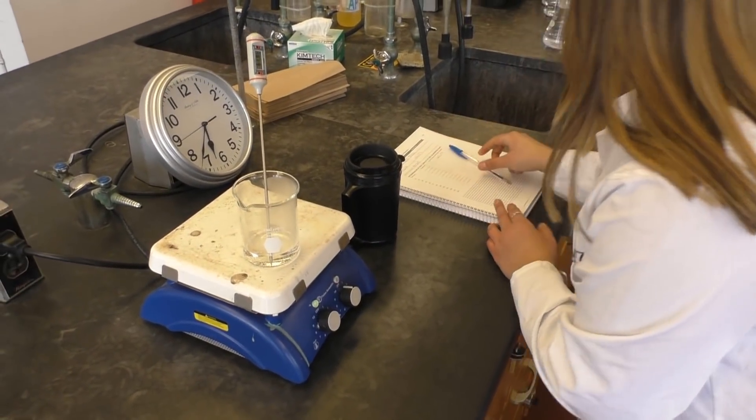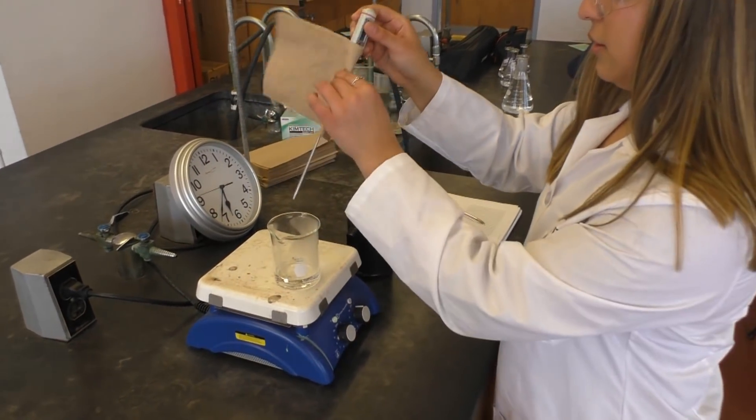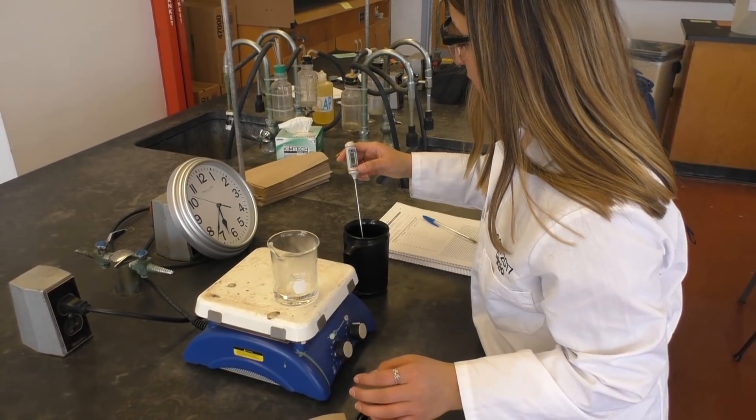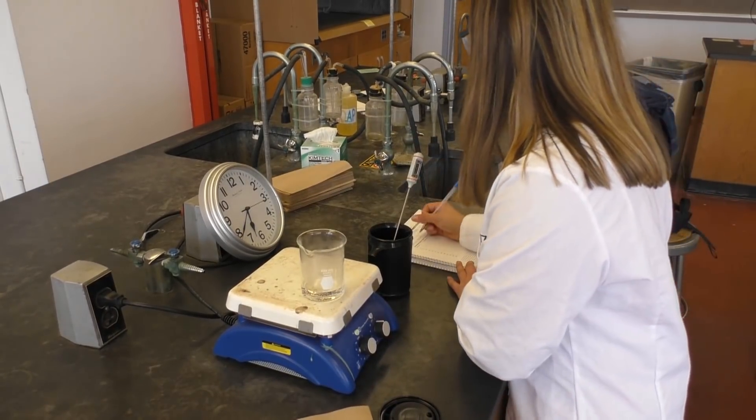Once your hot water has reached between 60 and 70 degrees, quickly write down its temperature. Then move your thermometer to your cold water in the calorimeter and write down its temperature.